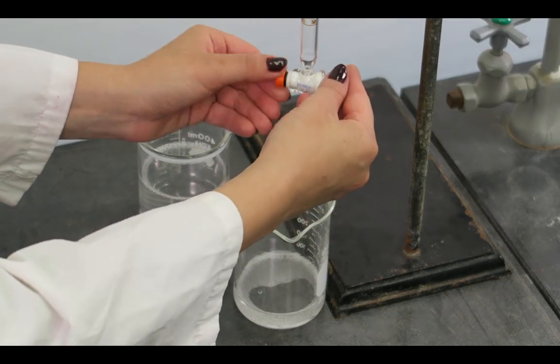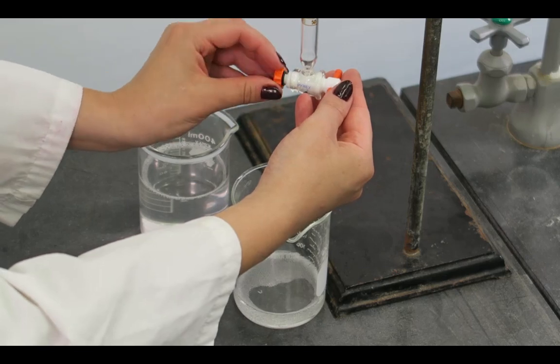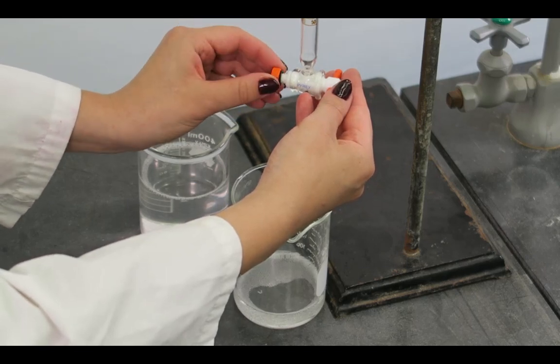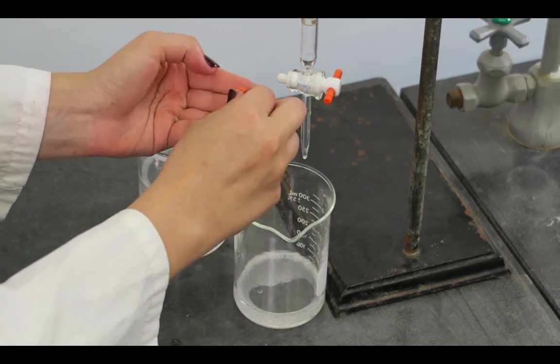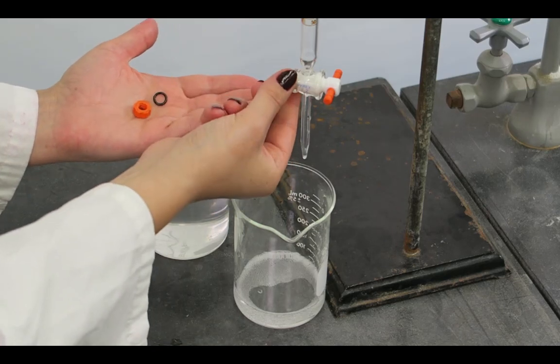The stopcock must be taken apart to be cleaned. First, remove the teflon nut, the rubber washer, and the teflon washer. Then, remove the stopcock.